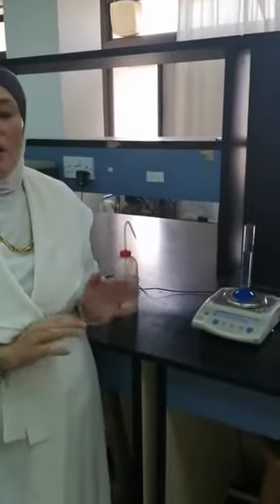By using the previous equation, we can subtract W4 from W1, then subtract W3 from W2 to get directly Vg. Then we can divide 2 grams by this volume to get the granular density.